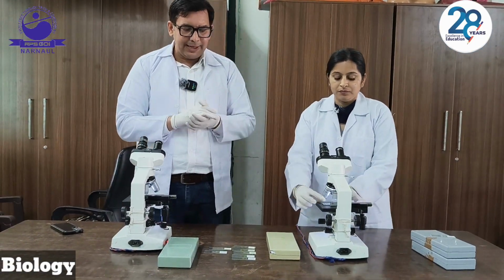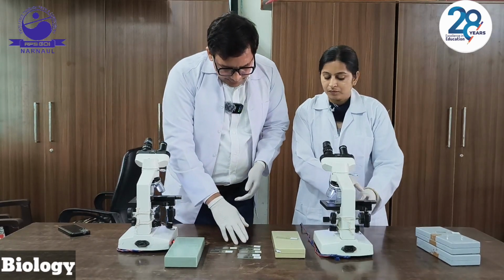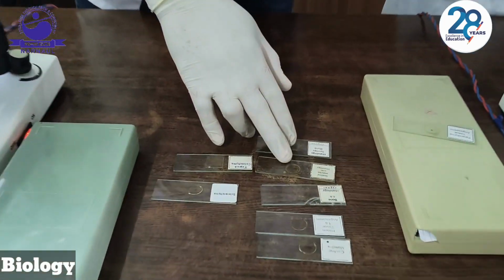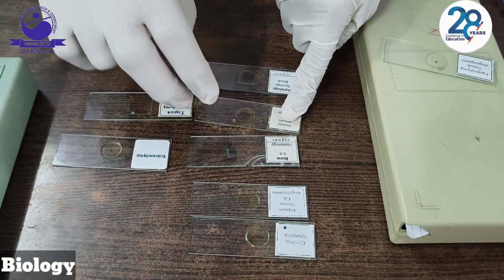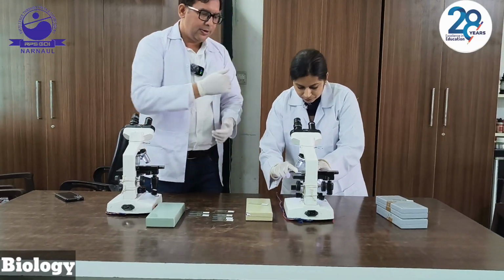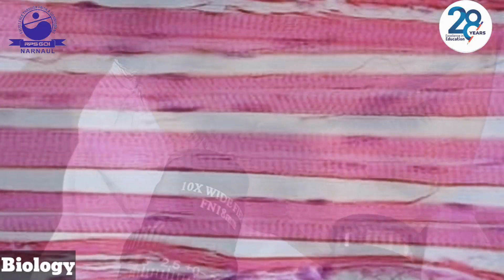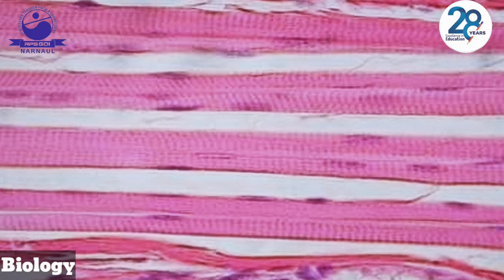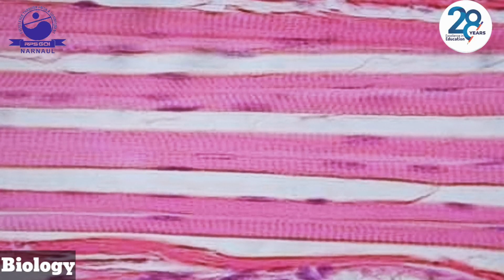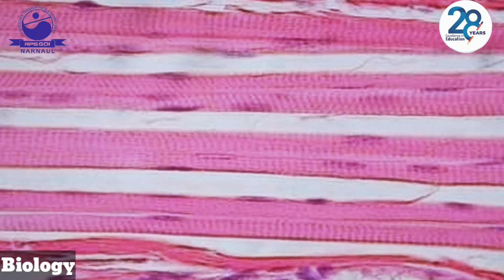Okay students, after the plant tissues, now we are moving towards the animal tissues. First of all, we are going to see the striated muscles. Okay students, this is the skeletal tissue. Cells are almost cylindrical, unbranched. Mostly they are voluntary. They contract rapidly and they get fatigued soon.